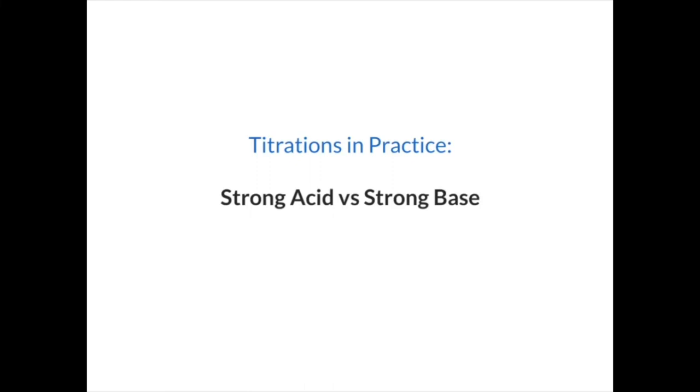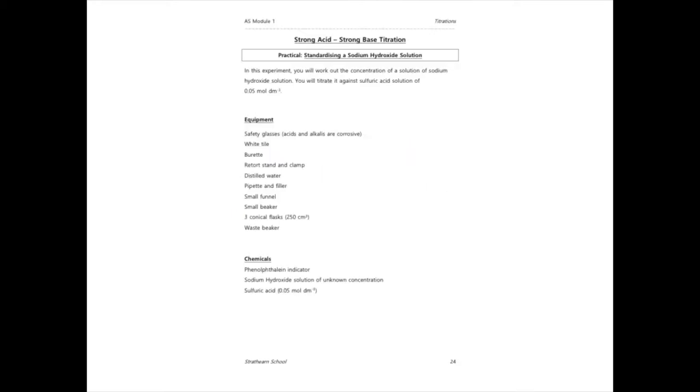In this video, we're going to start looking at titrations in practice, starting with strong acid versus strong base titration. So this is the point in the topic at which you would be starting your practicals, starting practicing that technique of titrations and getting them really accurately and building up that skill.